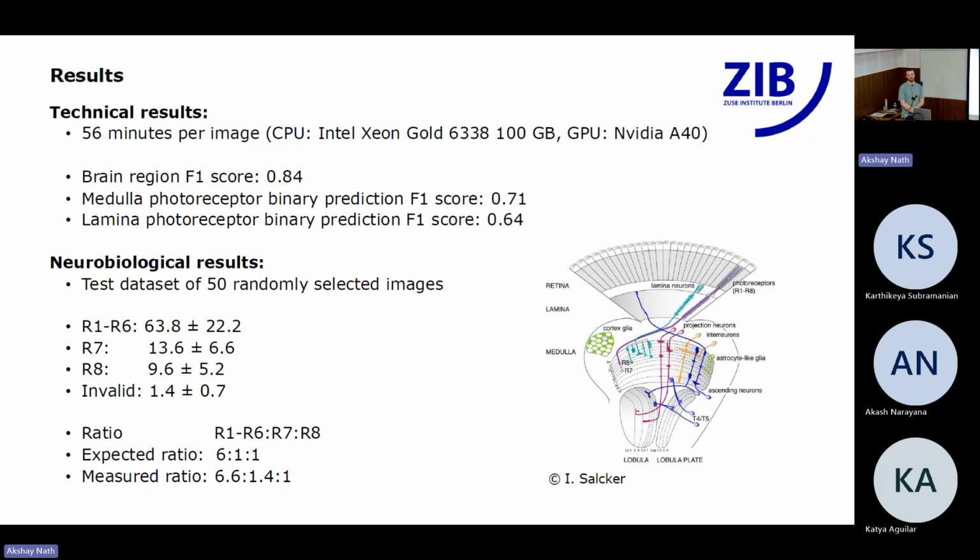Yes, so it does improve the quality, but I don't know. We saw satisfactory results with what we have done, so we didn't really attempt to have more images. So does it make sense to do testing on some phantom kind of synthetic region?